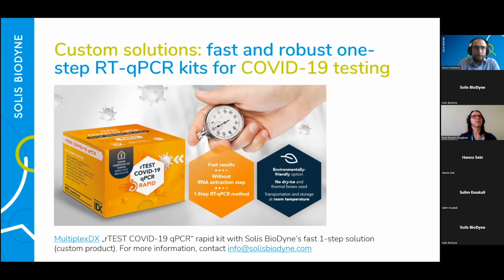Yes, if for some reason there is a need. Otherwise, I would say that for standard slow protocols, we don't recommend SolisFAST because the enzyme is really designed to be a fast enzyme. And we have seen that when you use very regular Taq polymerase cycling protocols, then it is not performing that well. So there are some limits, and we have mapped out the limits.